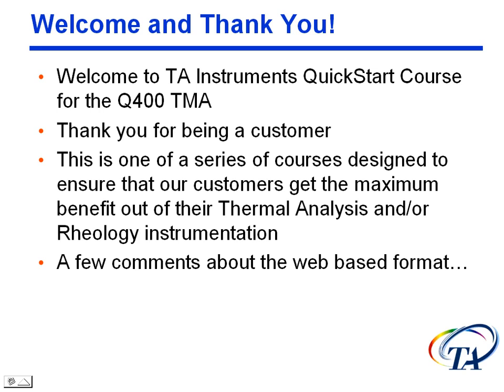Now, ideally, we would like that the TMA is sitting on your bench, already installed. If you haven't had the TMA installed yet, that's okay. But what we'd really like for you to be able to do is, as soon as you finish this class, be able to go right there on your TMA and be able to run data.